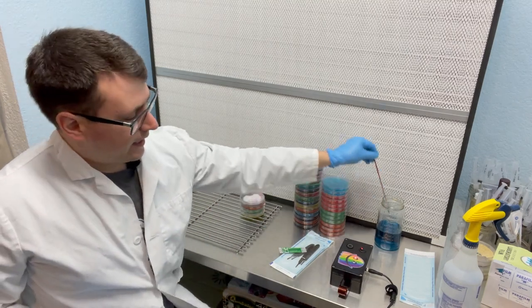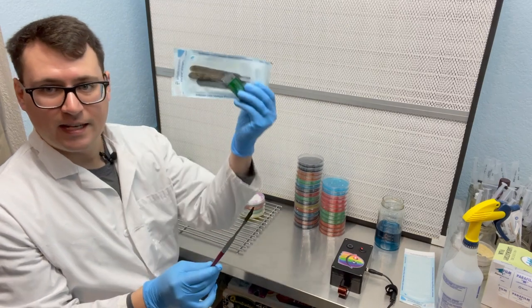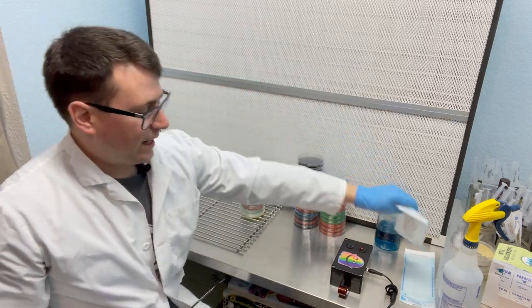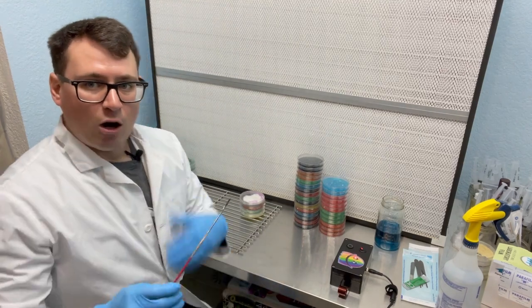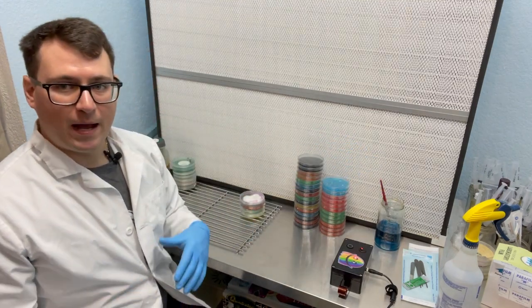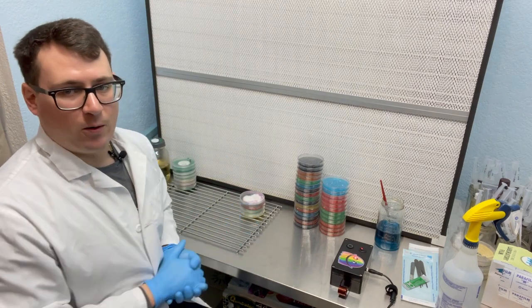However, I think that implementing these blades with a longer handle is going to give me the same results as using a steam sterilized scalpel, and it's going to save these plastic pouches from ending up in the landfill, and also save those blades over the course of the life of my laboratory here. Okay, so that goes over my preferred methods for doing my lab work. Now I'll talk about the procedure that I'm going to set up here.